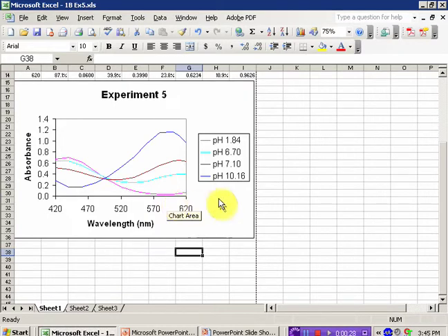Your lab manual suggests using a wavelength that shows the largest difference between the basic and the acidic pH, and just visually it's going to be over on this side of the graph. I have two data points with very similar values for the difference between these two. The pink line down here is the same at both of these values, 0.0357. The blue line has a slight increase at this 600 nanometer wavelength, so I'm going to use 600 nanometers for my absorbance values.